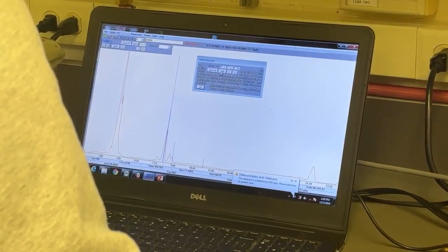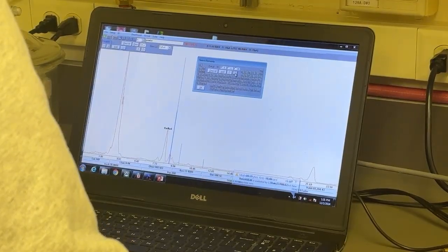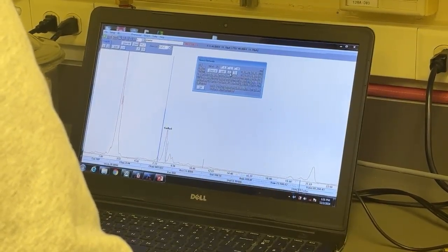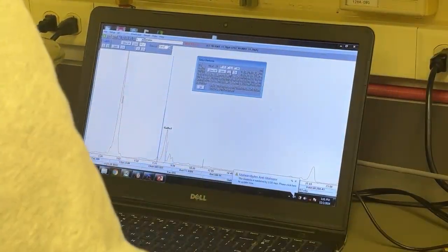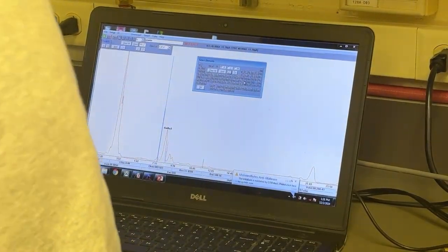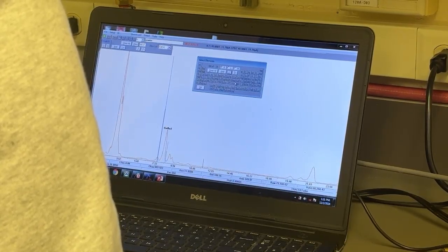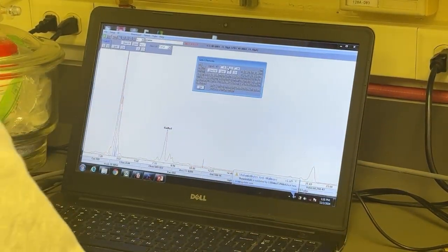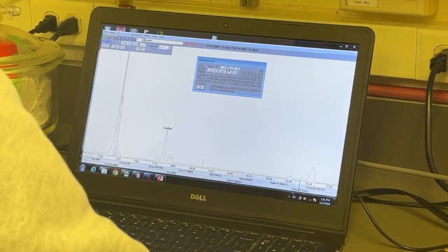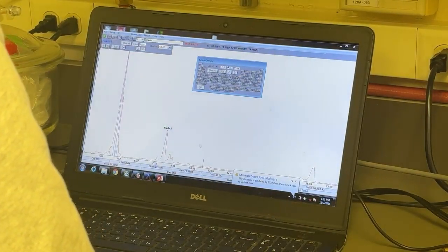And then we have some zinc. Some zinc. Okay. The nickel still comes from that device. It's not there. So let me check the silver. Yeah, this is right. This is the K line, and then this is the L line. So we definitely have a pure silver, and those two peaks are silver.